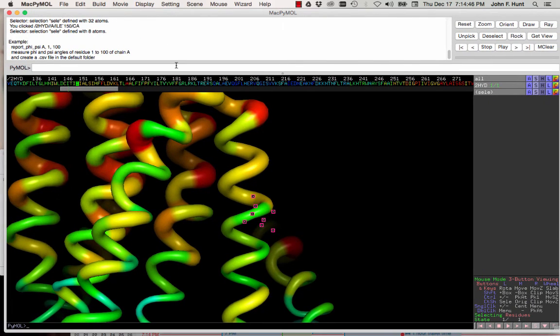It turns out there is some bug, not in the script I would say, but rather in the Mac version of Pymol, and it will not actually take the proper end residue of a polypeptide. This is chain A that we're in, I believe.